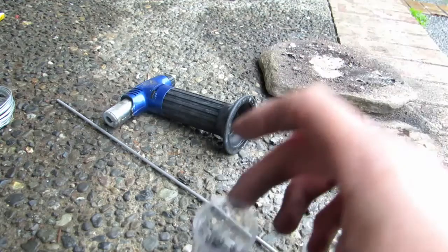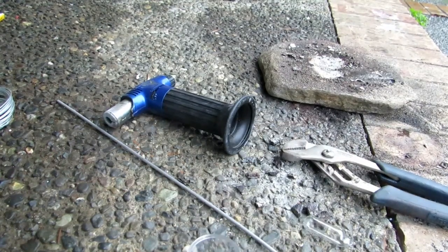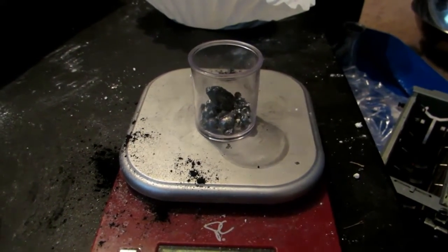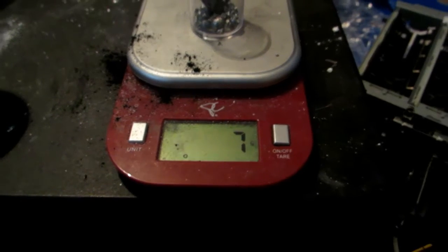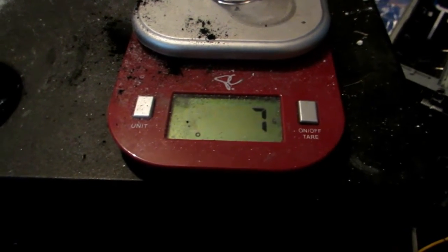I'm very excited with this. I'll meet you inside and we'll see how much we got on the scale. So I removed all the manganese metal, zeroed the scale with the little container, and then inserted all the manganese back in. We got 7 grams of manganese metal from that 50 grams of manganese dioxide.